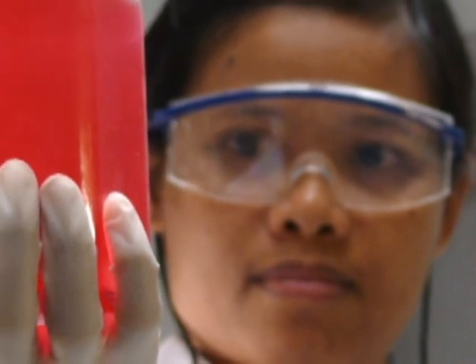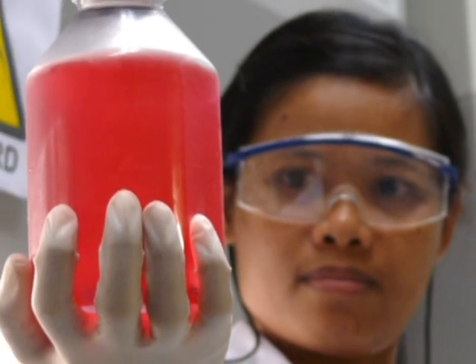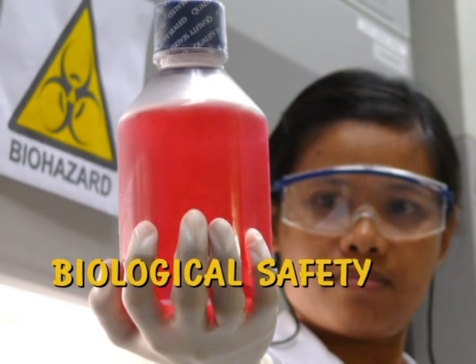The proper use of personal protective equipment can significantly reduce your risk from exposure to potentially infectious materials. Remember that even if other safety controls are employed in your facility to eliminate or minimize biohazards, personal protective equipment remains your last line of defense against potential exposures. The effectiveness of that defense is literally in your hands.